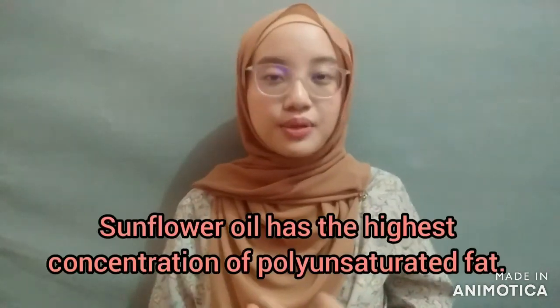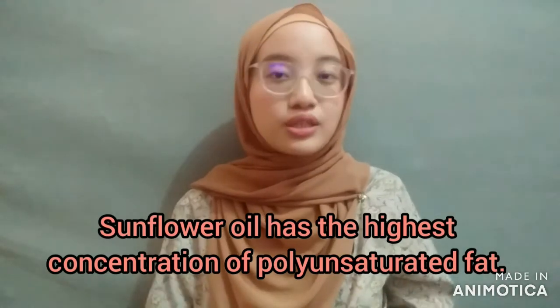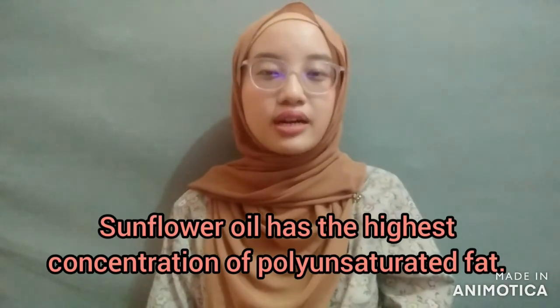This is because sunflower oil is composed of a lot of unsaturated carbon inside its molecular structure, so that is why it needs a lot of bromine water to decolorize its lipid solution, until we get only excess bromine that doesn't have any chance to react with the alkenes.